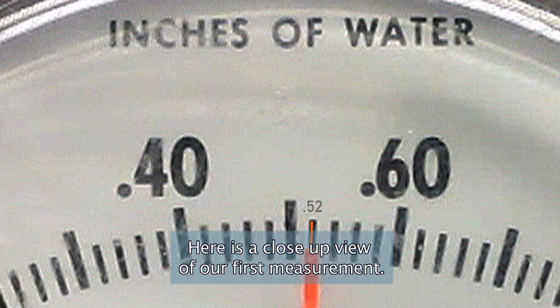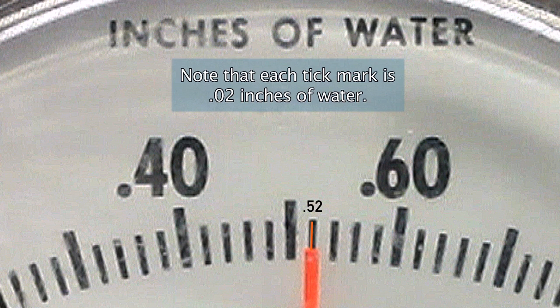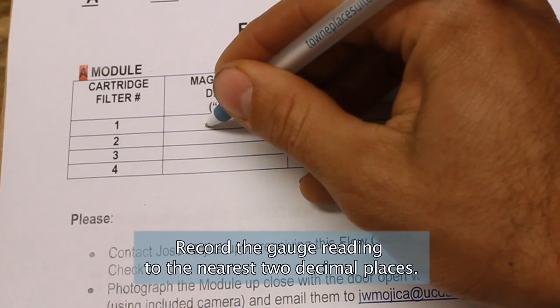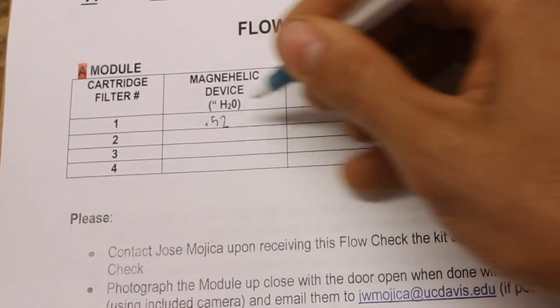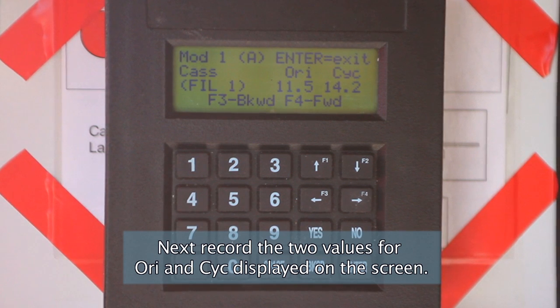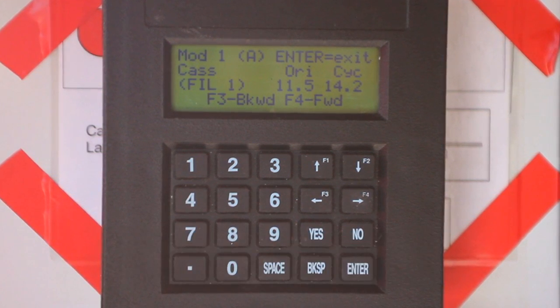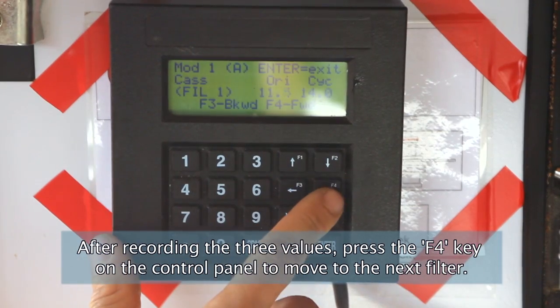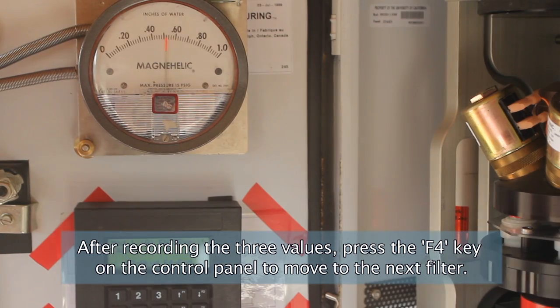Here is a close-up view of our first measurement. Note that each tick mark is 0.02 inches of water. Record the gauge reading to the nearest 2 decimal places. Next, record the 2 values for ORI and CYC displayed on the screen. After recording the 3 values, press the F4 key on the control panel to move to the next filter.